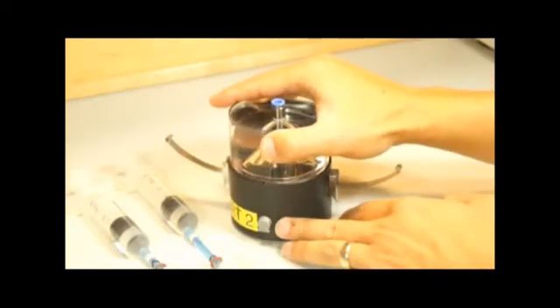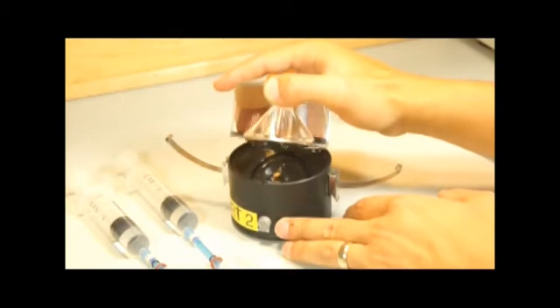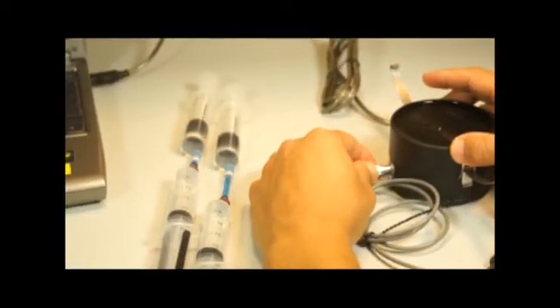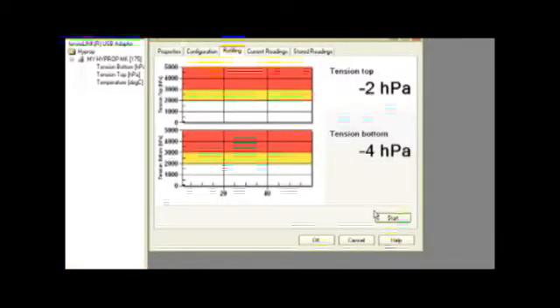Remove the degassing chamber from the HYPROP base. There should be about 1mm of water on the sampling base and around the chambers. Now connect the base to the computer and start TensioView. This lets you monitor pressure as you screw in the tensiometers.